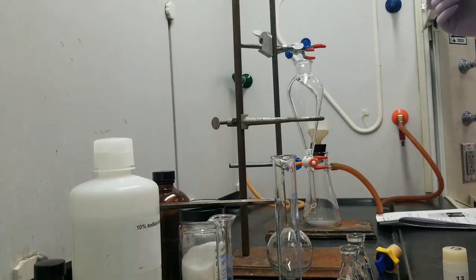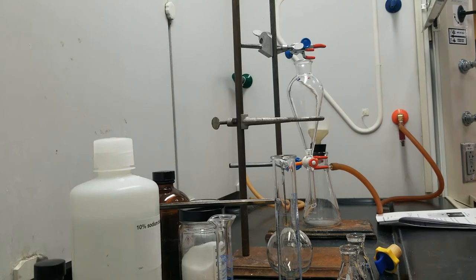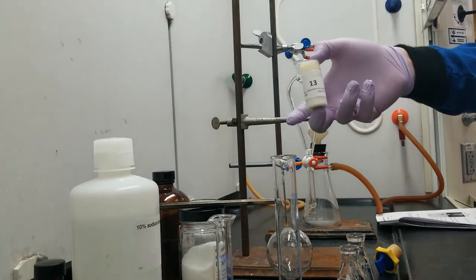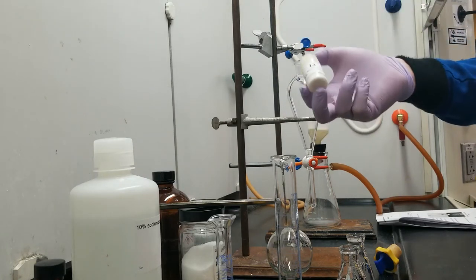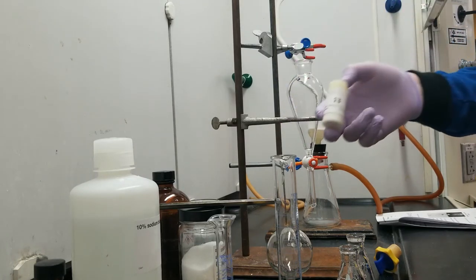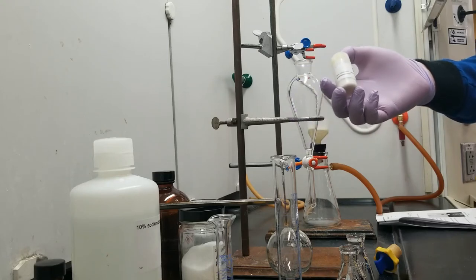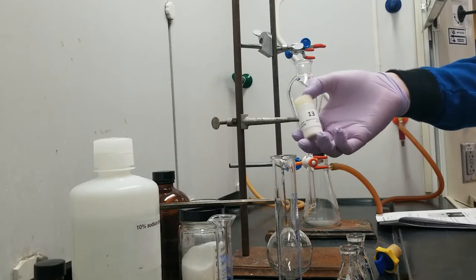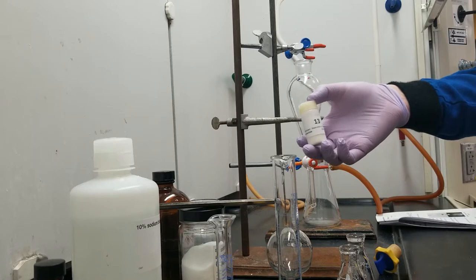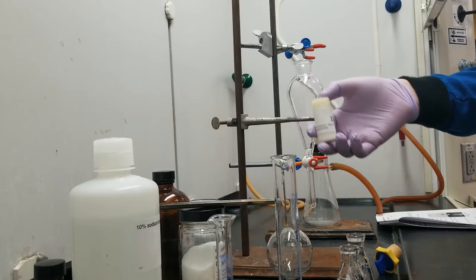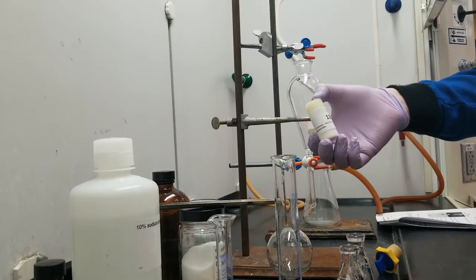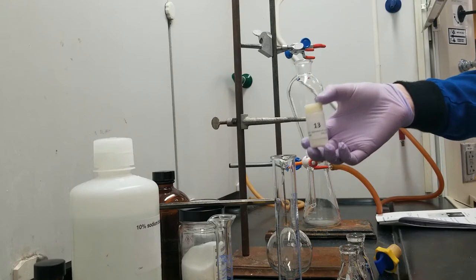Welcome back everyone. So today we're going to be doing a two-component extraction. Let's start by introducing our unknown. I chose number 13 because my birthday is on the 13th. So within this unknown is a combination of two different compounds: acetanilide and 3-chlorobenzoic acid.